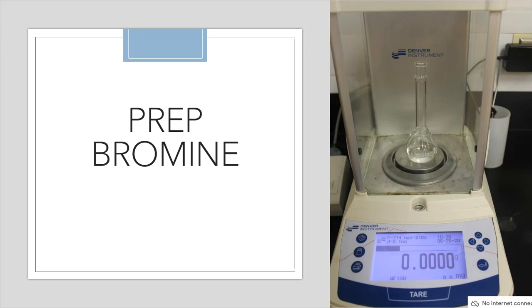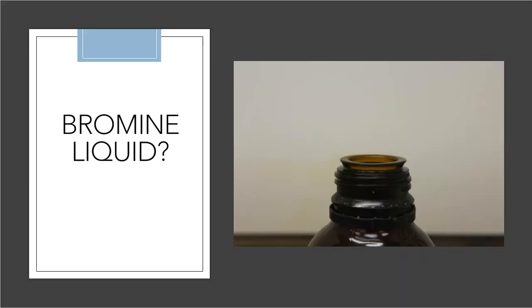So I'm going to go back to my bromine bottle, and I'm going to take the lid off of the bromine, and I do this under the hood. The reason is that bromine loves to react with moisture, and that Br2 will react with even water vapor, and you can breathe that into your lungs, and all of a sudden you have hydrobromic acid in your lungs. You'll go to the hospital with chemical pneumonia, all right? That's something that we don't want.